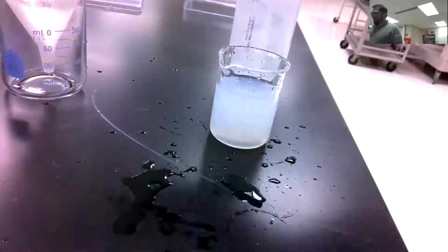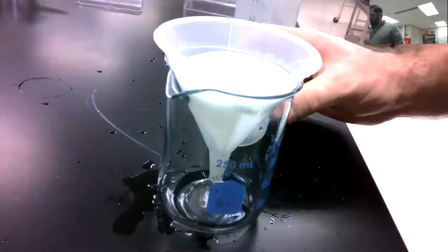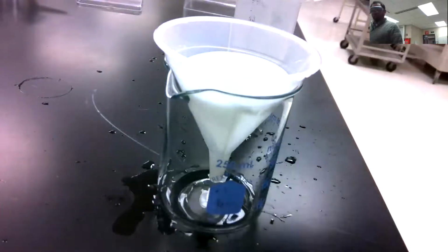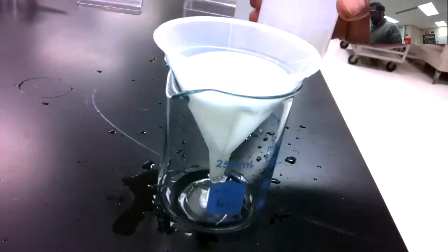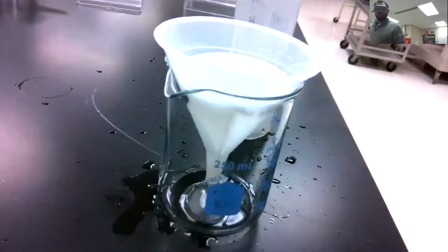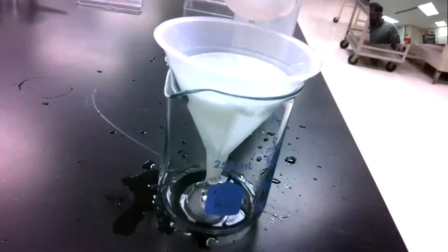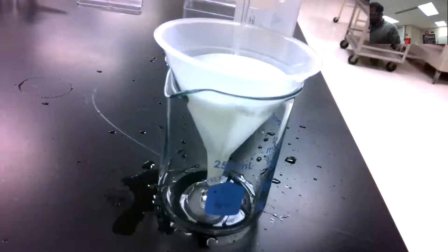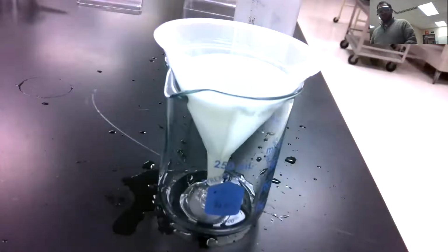Now we are ready to decant. So slowly, I'm going to pour my solution into my filter paper. I want to do that slowly, and I want to make sure it doesn't come up and over the edge of the filter paper. Once it does, the solution can come up and over, and I'm starting to lose product. It'll have been draining into the bottom. This is going to be like watching paint dry.